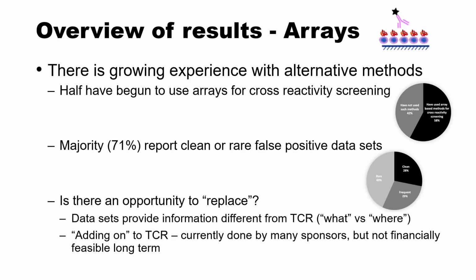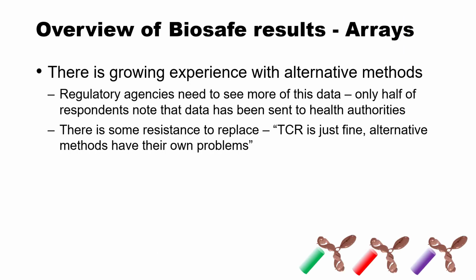And we're looking for opportunities to potentially replace it with more experience with these array technologies. So bottom line is that there is growing experience with these alternative methods. But we have discovered through discussing the results of this survey with our health authority colleagues at the FDA that the regulatory agencies need to see more of this data, even if it's just exploratory, because they need to understand what the variability is, what the value of the data that they're getting out of it is.